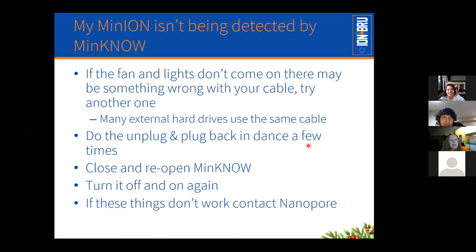You may need to unplug and plug back in a few times, close and reopen MinKNOW, turn the computer off and on again, the usual things you might try. If these things don't work, you need to contact Nanopore because there's a problem.